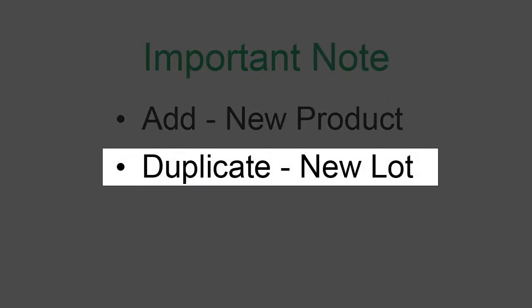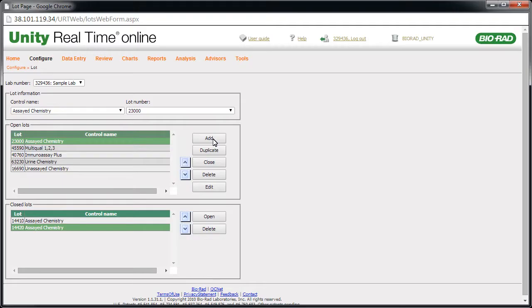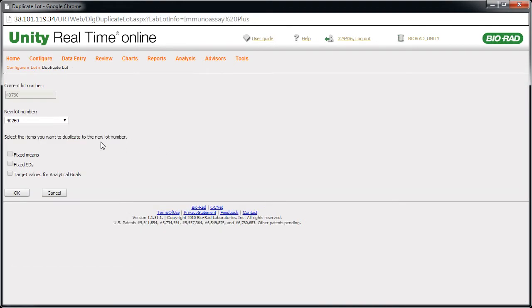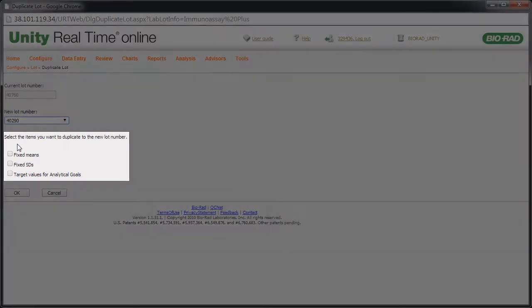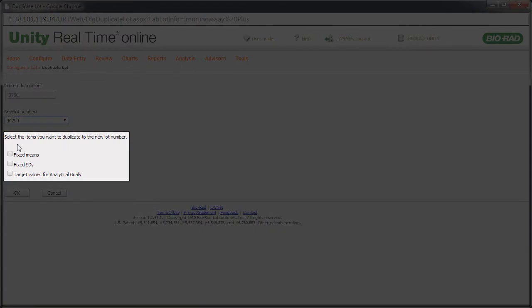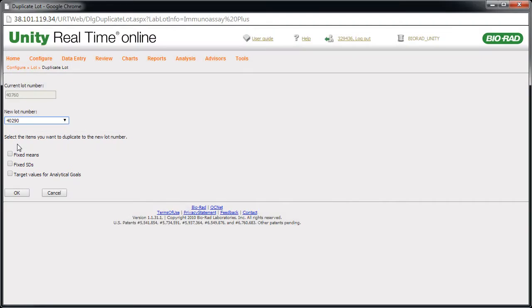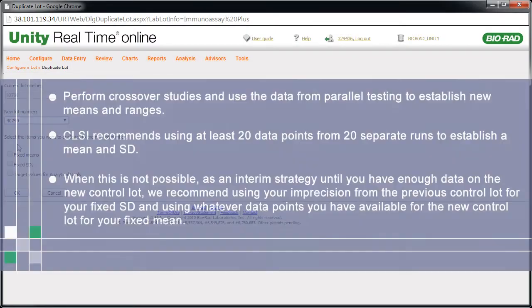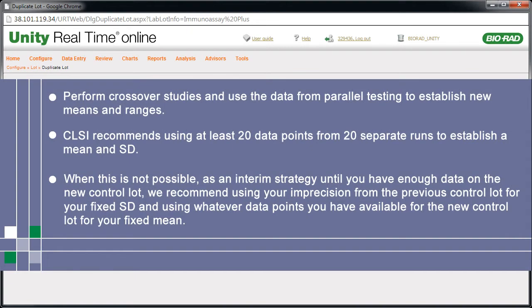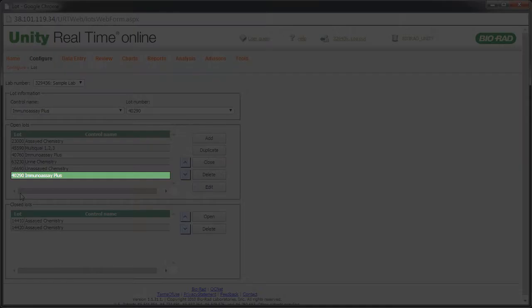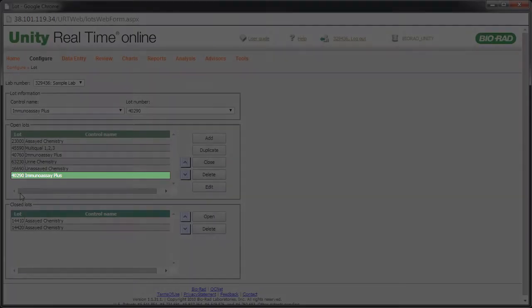Now let's take a look at duplicating a lot. Select the lot number you want to duplicate. Click Duplicate. Select the new lot number. You have the ability to duplicate each item listed here. We recommend pausing the video to review this note on best practices. Click OK. The new lot number appears.